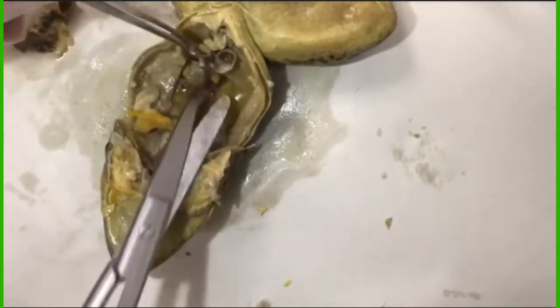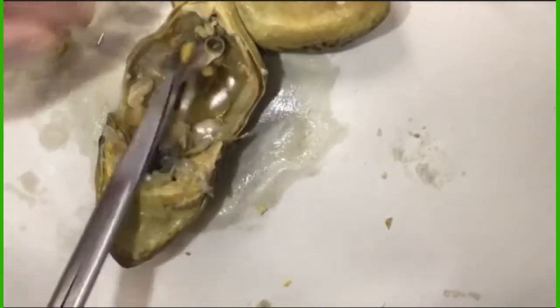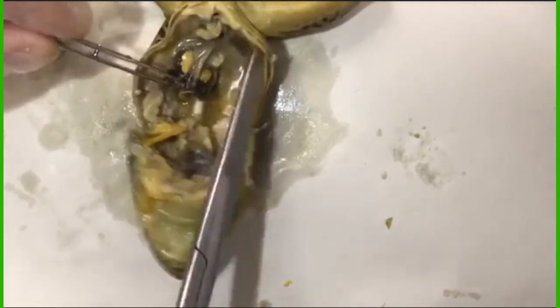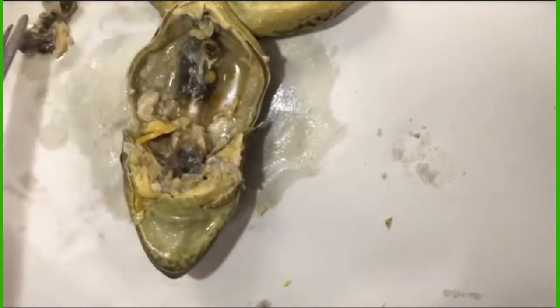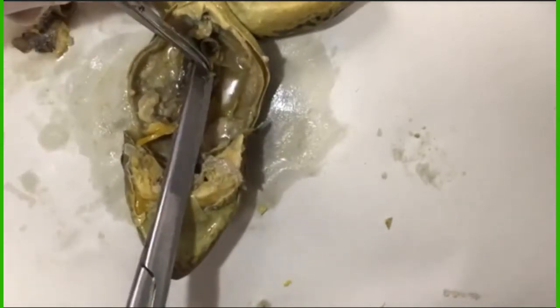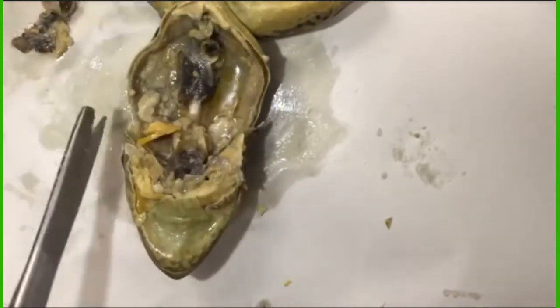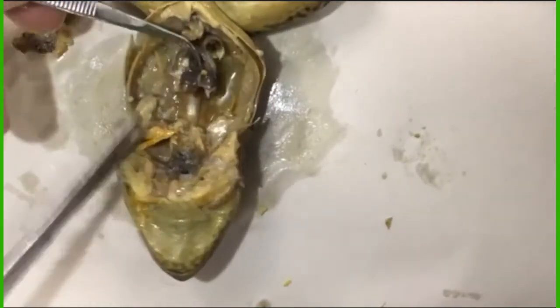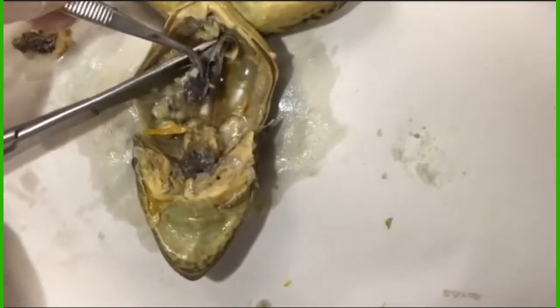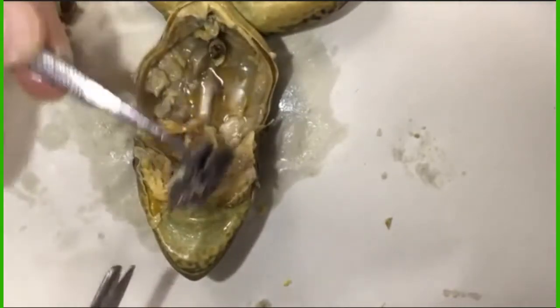So now I'm getting underneath the kidneys. Those are those dark organs right up against the spine. And it's best to get them from underneath, kind of at the top. There's a little bit of fat left on the kidneys, so I'm getting rid of that. A little bit of fat on the other side. Don't confuse that for testes, because it's not. We already removed the ovaries. We know this was a girl. But getting underneath the kidneys so we can remove those. And you can just see the base of the large intestine there right underneath.